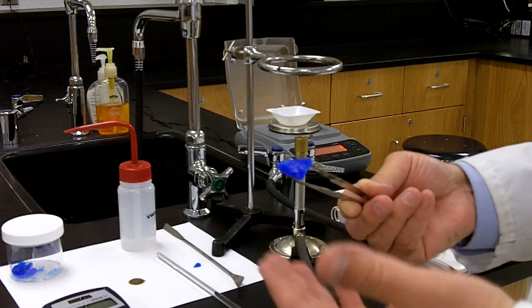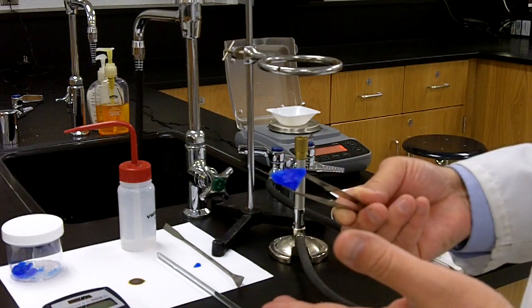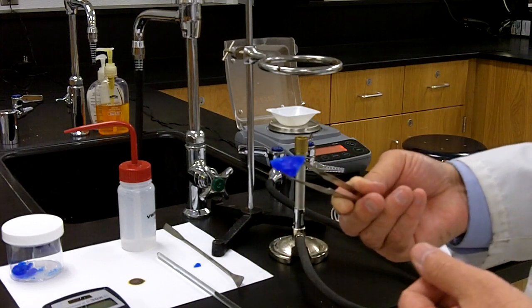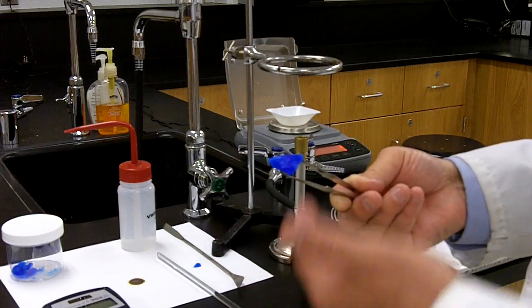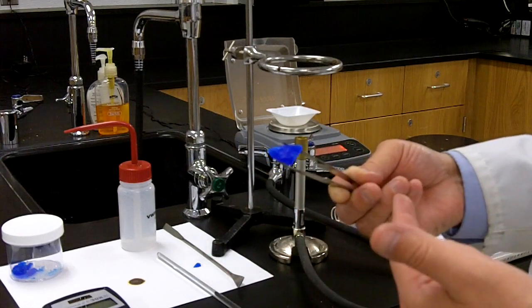In fact, every formula unit of copper 2 sulfate pentahydrate contains five molecules of water. And so it's going to be our job today to experimentally determine the percentage of water in a hydrate.